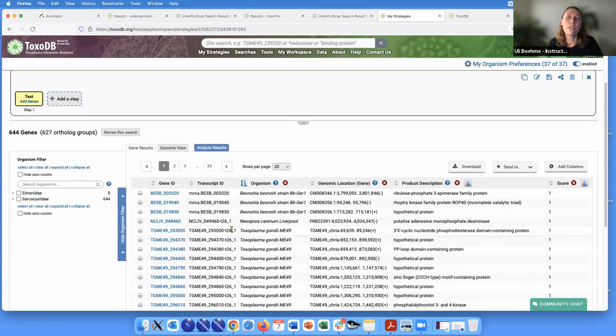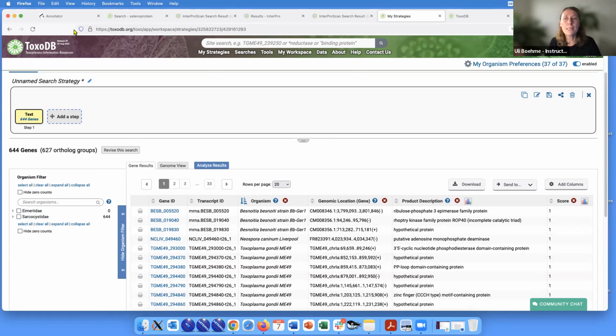And so you will see it on the gene record pages, or like I've done before, searching for selenium proteins, those will come up then as well. So it's quite nice that Apollo is connected with our gene record pages. You can see the gene models in the community annotations track, and you can see the function annotation also on the gene record pages.